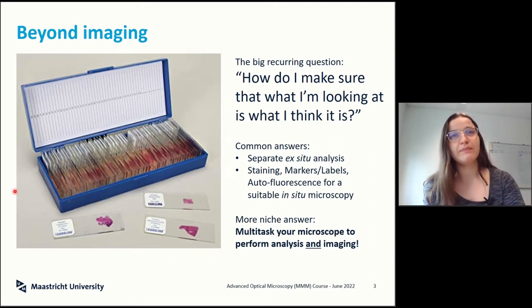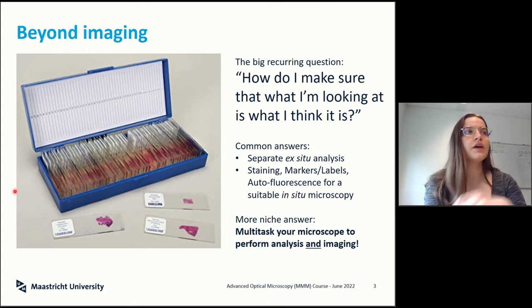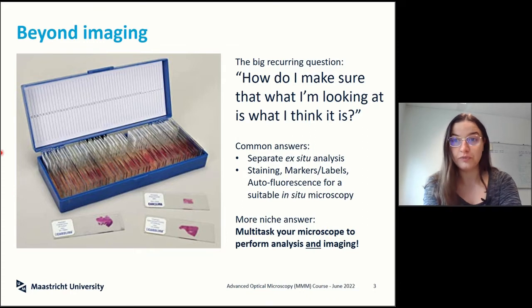But there is also a possibility for a slightly more niche answer, which is to make sure that your microscope can act as a microscope, so as a tool of imaging for you and your eyes, but it will also come with additional information coming from your sample under the same conditions. And this is exactly what Raman combined with microscopy can effectively do.